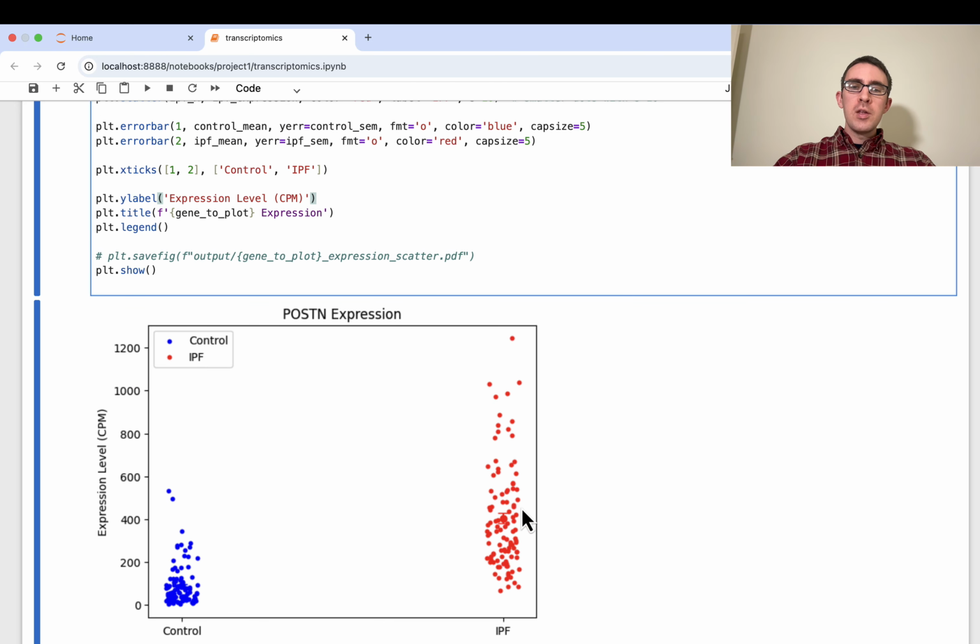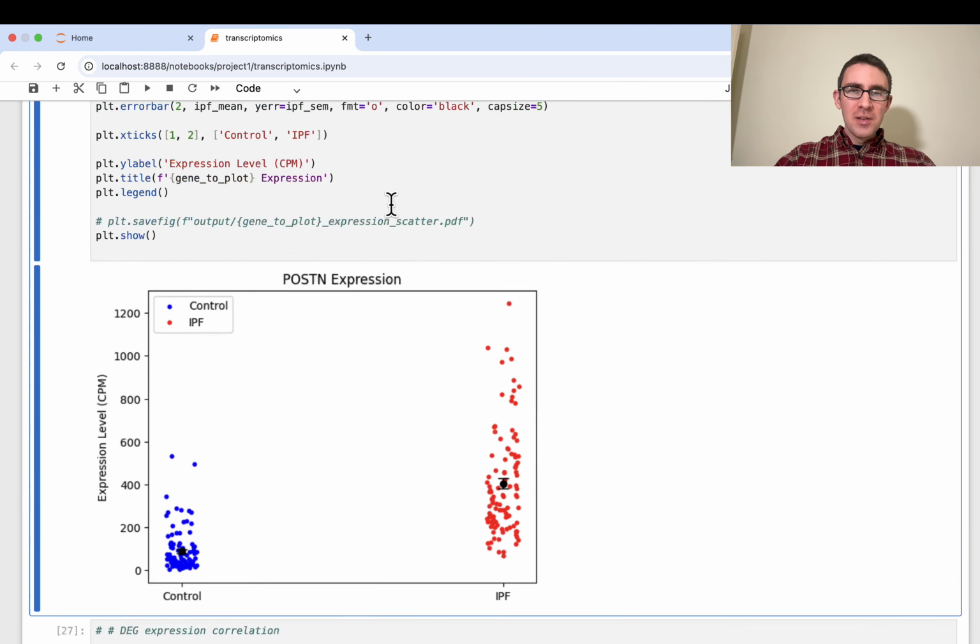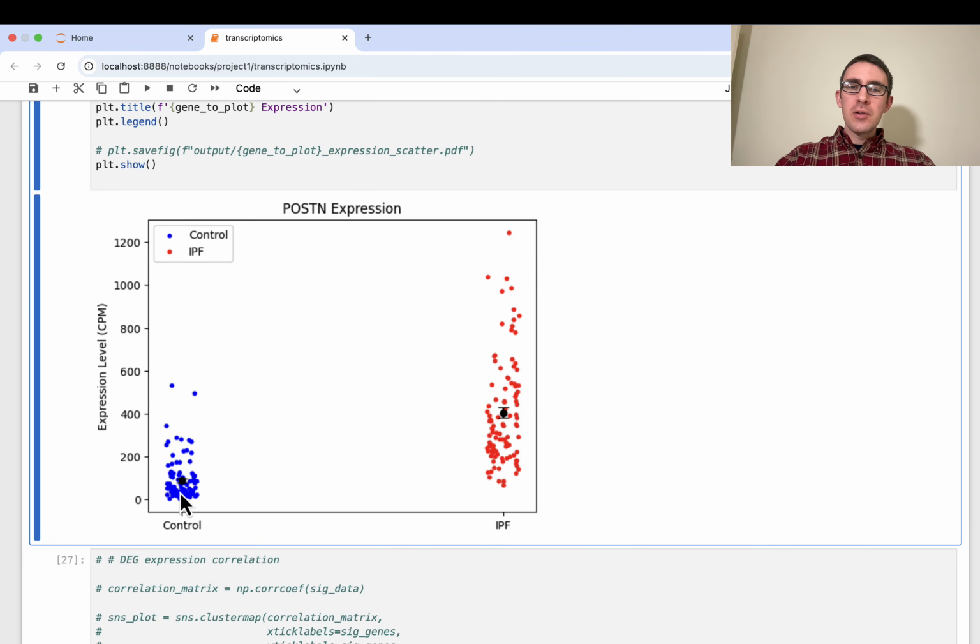You might want to make the bar here black, or make it a little bolder possibly. Or you know what? I don't know why I'm being lazy here. I'll just try to do that myself. Yeah, that's better. It's still a little bit tough to see for this one, but that's a little bit better at least.